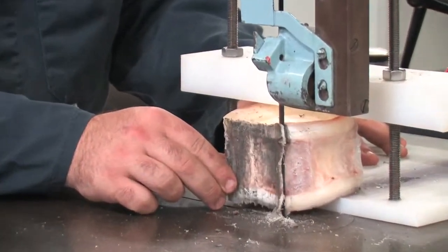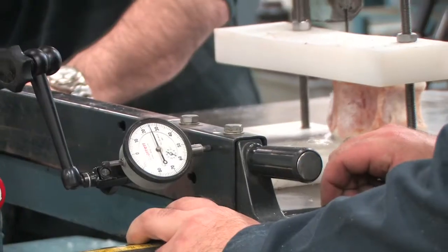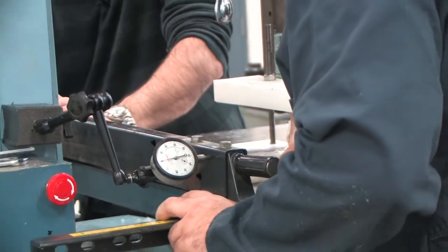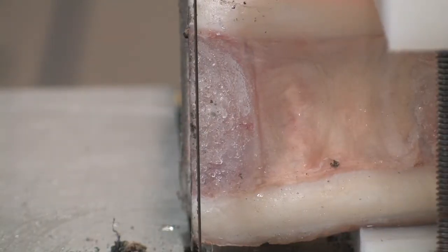Be sure to always use caution when working with bare hands around the blade of the bandsaw. You'll want to cut the sections at least 1 to 1.5 mm in thickness. Be sure to take into account the thickness of the blade as well when calculating this measurement.